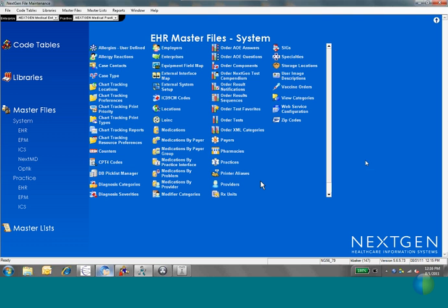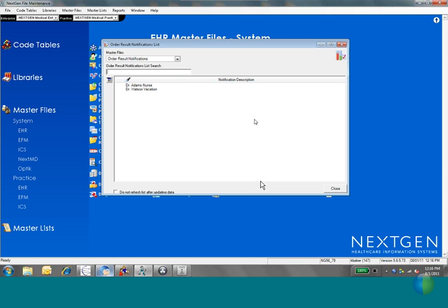In addition to that, there's a couple other tables that we can talk about. Let's go up here first. The Order Result Notification table. This is a very, very optional table. This is something that we've had for a really long time, and it's now being somewhat replaced by the Workflow Manager from the EHR admin menu. And this particular table, stemming back to what I said earlier, remember how I said results can either go to a task or they can go to a PAQ.